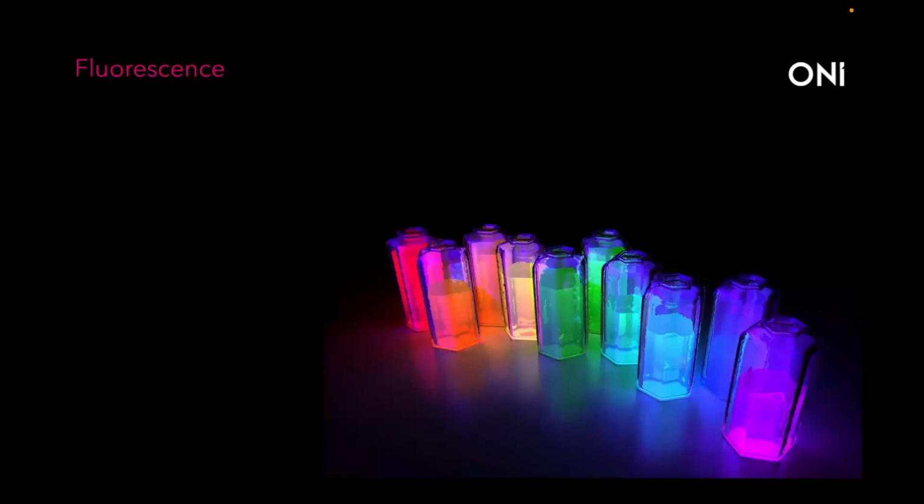It's essentially a way of using the unique photophysics of certain molecules to enhance contrast. The way that fluorescence works is that you have your fluorophore. Typically these can be fluorescent proteins, but they can also be organic fluorophores such as this, which tend to be the brightest and most stable.